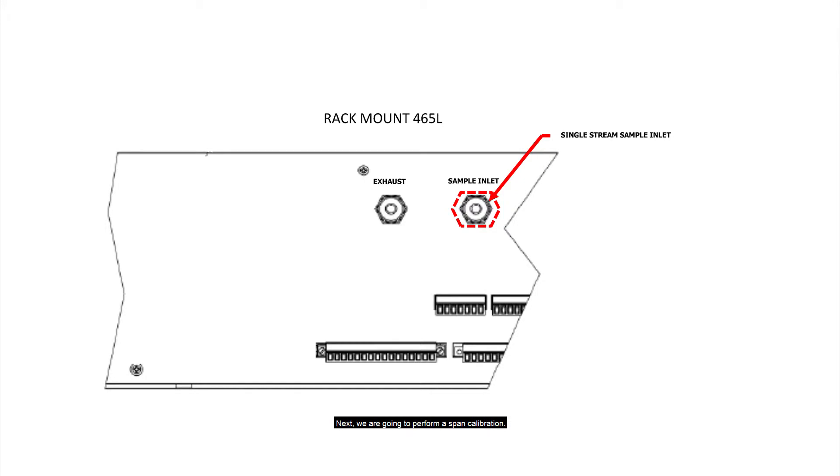Next, we are going to perform a span calibration. Start by connecting the span gas source to the sample in port.